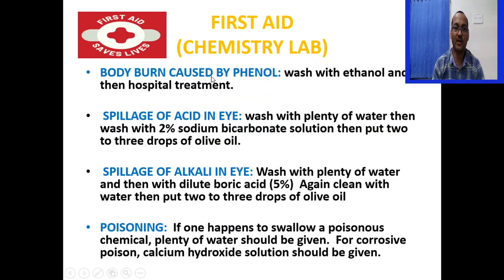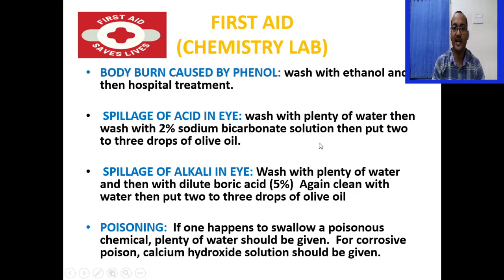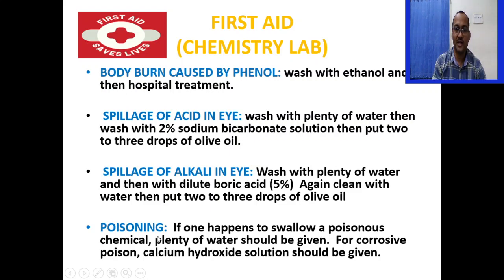If there is a body burn due to phenol spilling, wash it with ethanol first, then go for hospital treatment. If there is spillage of acid inside the eye, wash it with plenty of water, then with 2% sodium bicarbonate solution, then put 2 to 3 drops of olive oil. For alkaline spillage in the eye, wash with plenty of water, then with dilute 5% boric acid, clean again with water, and put 2 to 3 drops of olive oil. For chemical poisoning, if someone swallows poisonous chemicals, plenty of water should be given. For corrosive poison, calcium hydroxide solution should be given.